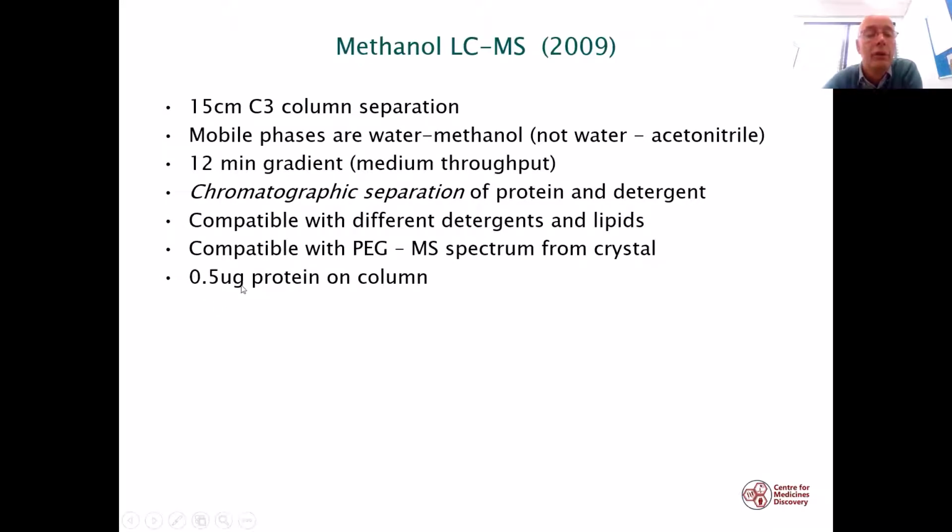And also we can handle a fairly small amount of protein. That's about the same amount of protein we would use in the standard intact mass analysis.